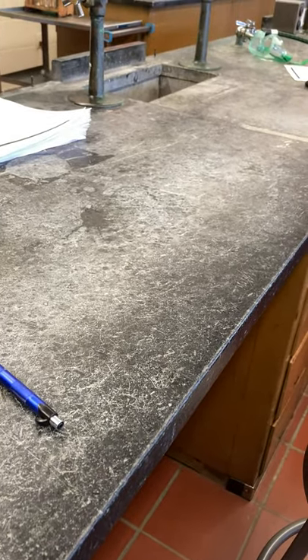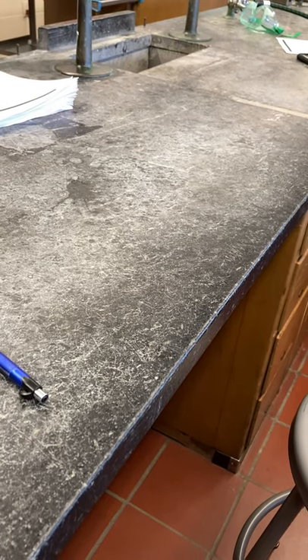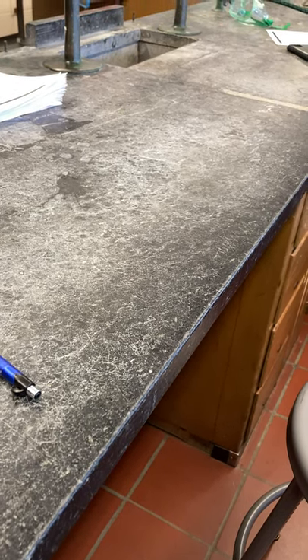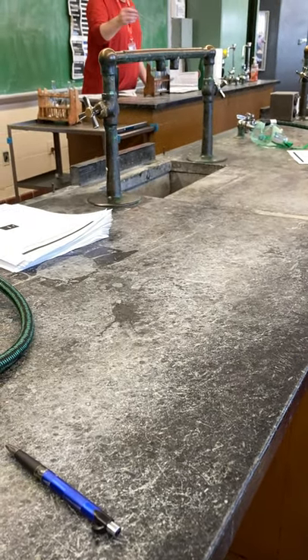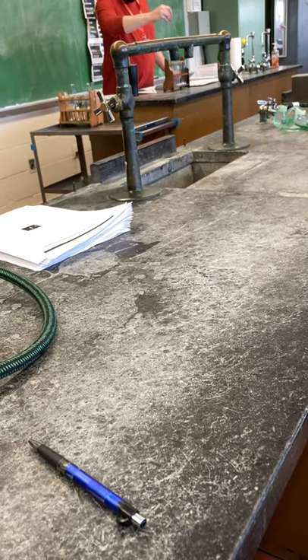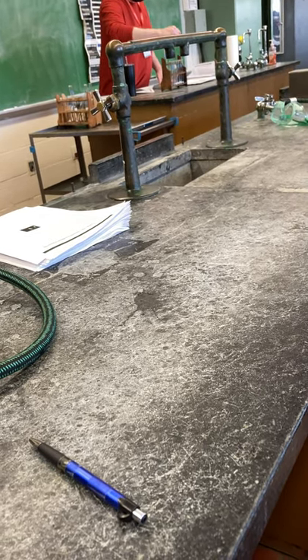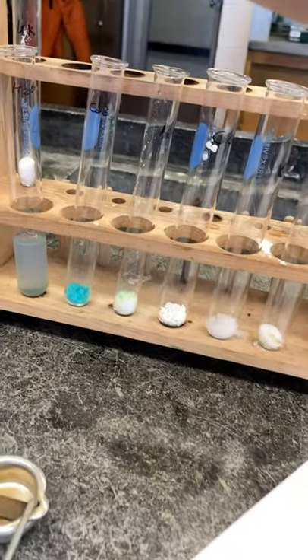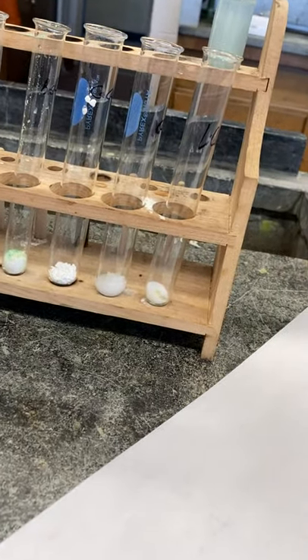I'm going to clean off my wire loop to make sure there are no remaining chemicals from before. You'll see that you have water as one of the containers, and the others are salt. I'll dip the loop into the water, and now that it's wet, when I put it into one of these chemicals, some will stick to it. Then I put it into the flame and identify the first color, because the loop is also metal and will start to add colors. That original color will be the strongest, and that's what we need to identify.